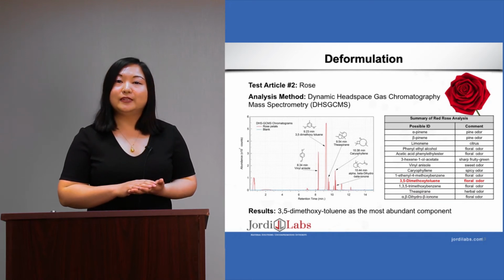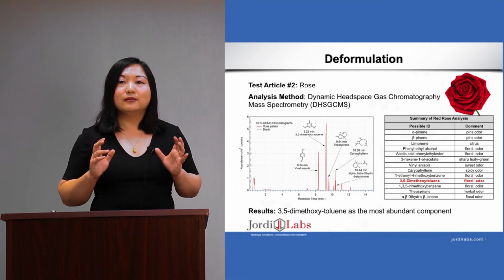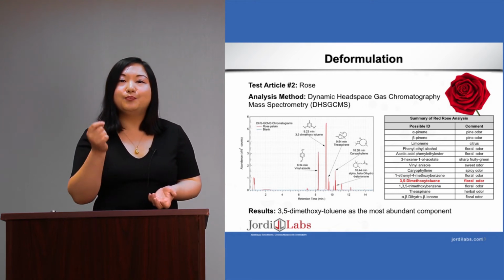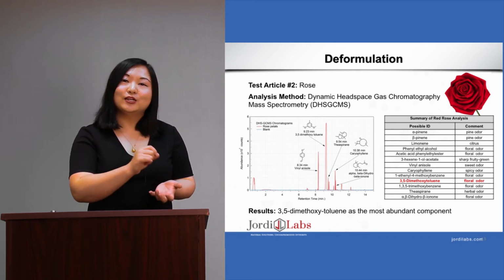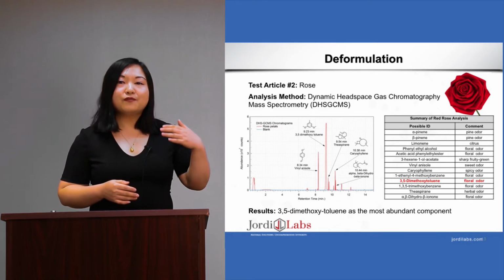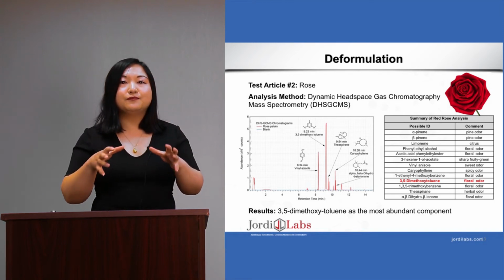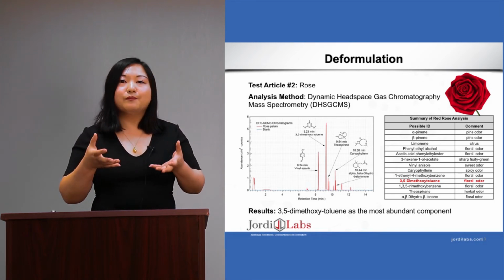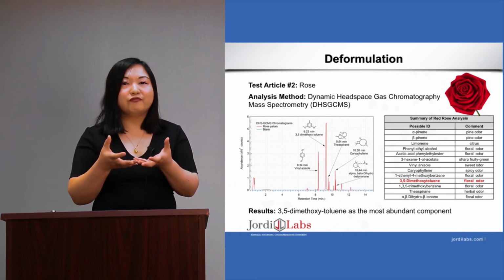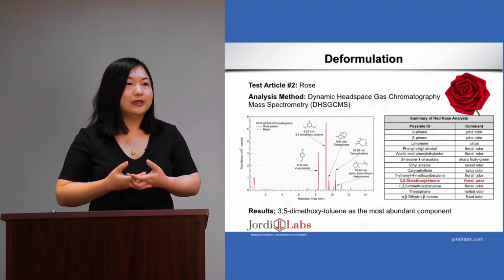Another advantage of this technique is that it does not require sample prep, so you can actually put a rose petal as is into the chamber and then you get your data. What we saw from the analysis is a mixture of different fragrance compounds. So the cocktail of compounds actually makes a rose smell very unique.